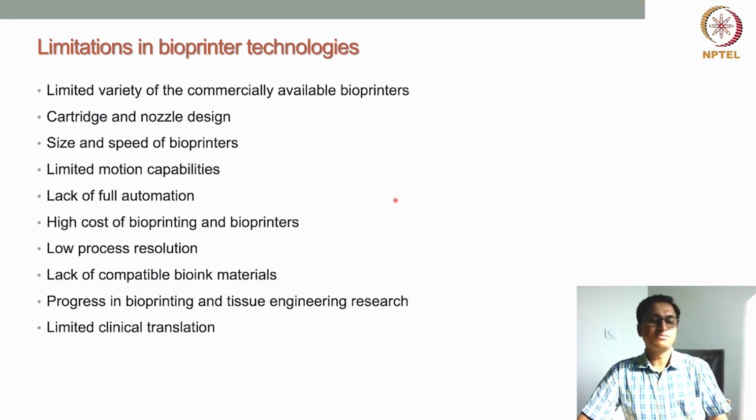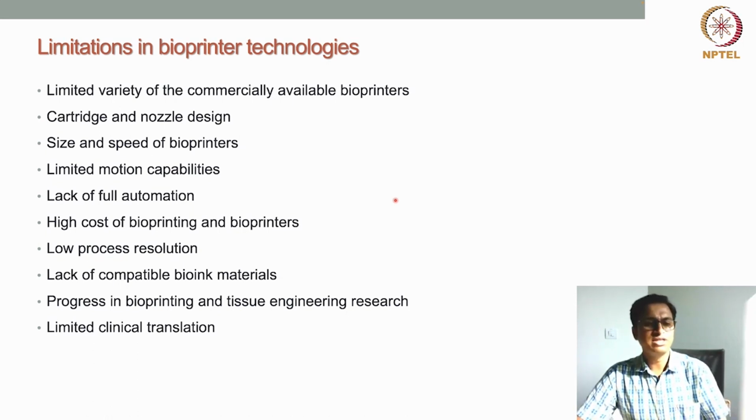The other thing is that for most bioprinters the resolution is not very high, except for inkjet and laser-assisted bioprinting. The resolution is not that high with extrusion-based bioprinting. So resolution is another factor that can be improved further.